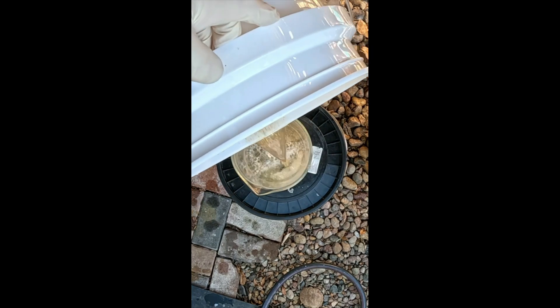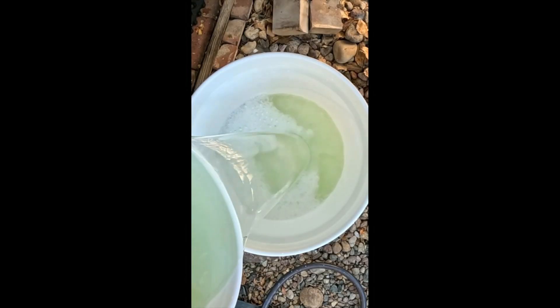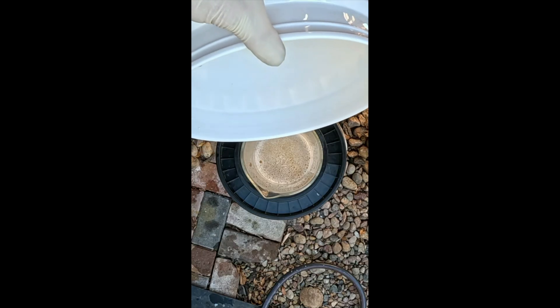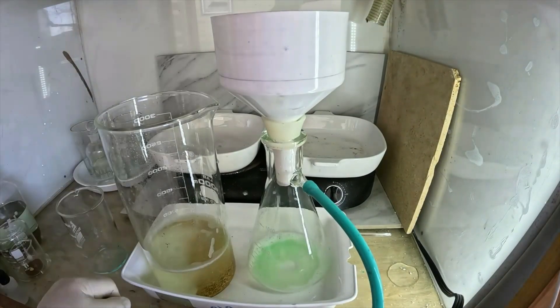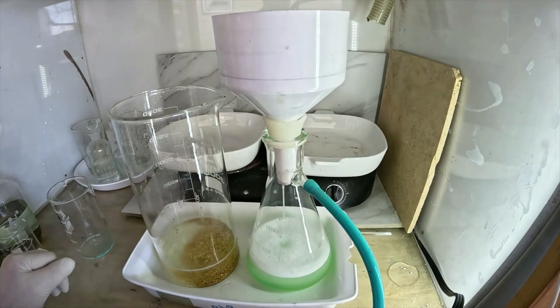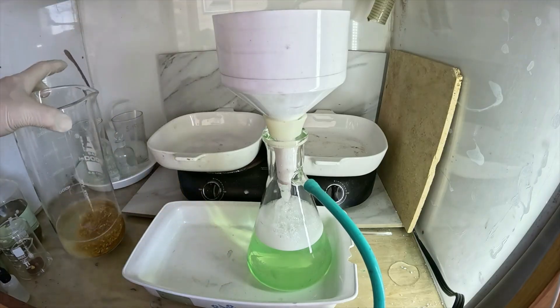I'll transfer the first bucket to the beaker, decant the water off the top of the foils in the second bucket, and then transfer that to the beaker as well. Here are our gold foils from the fingers. I'll run those through the filter to get all our foils into one single filter. To clean up and remove the Jet-Dry, we'll also do a couple of distilled water rinses as part of this filtering process.